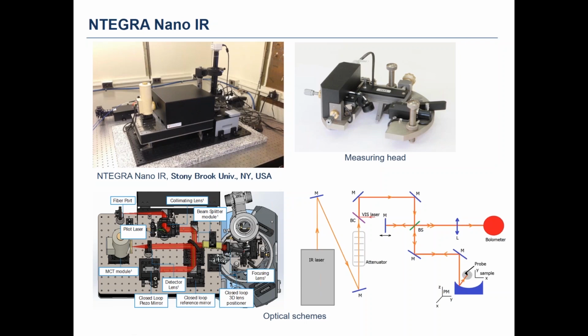Once we are going to scan, this parabolic mirror is placed on the piezo stage platform that allows us to scan it in X, Y, and Z directions. And then we make a scan by this mirror, and we get a hotspot and align the incident beam with the cantilever.